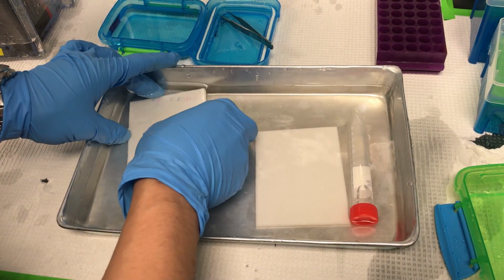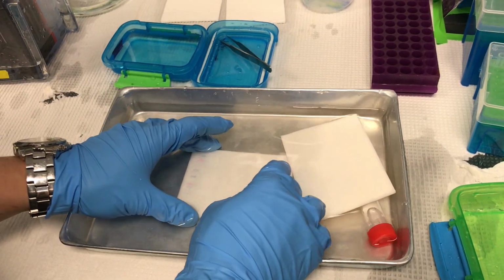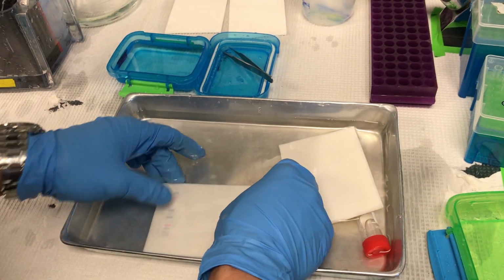Go through one or two steps of the blotting. So this stuff that I'm moving over is important. But the gel, okay, like have the gel out and then have it roll. That's like one step, right? So show the important steps.